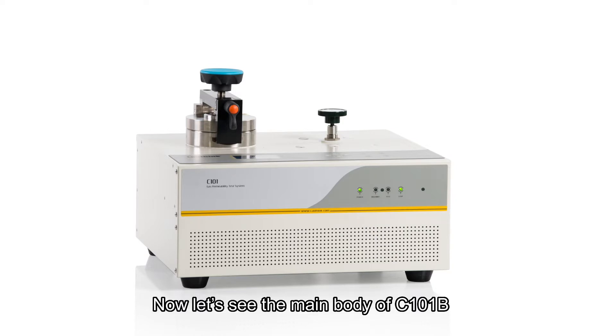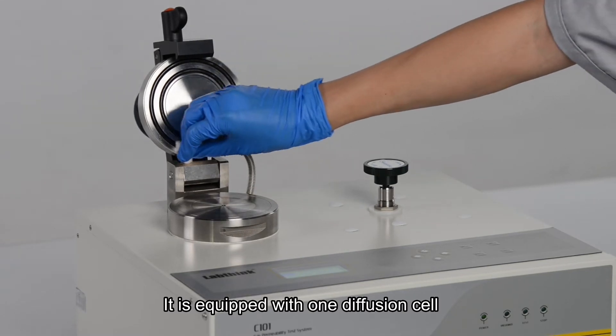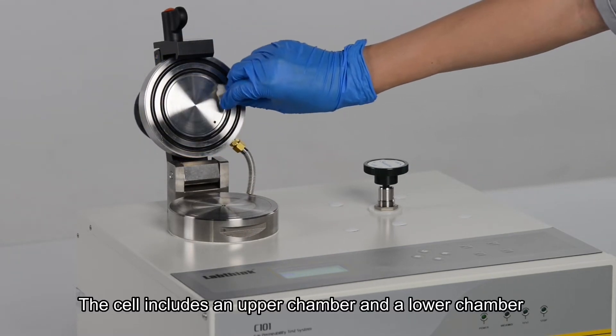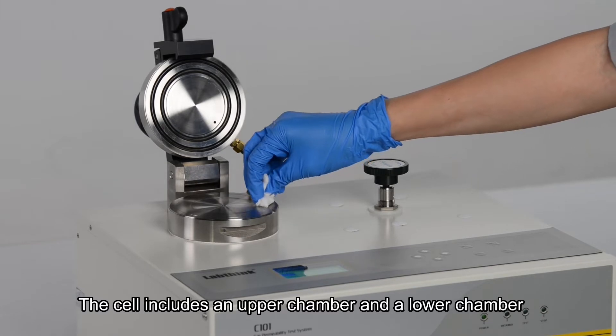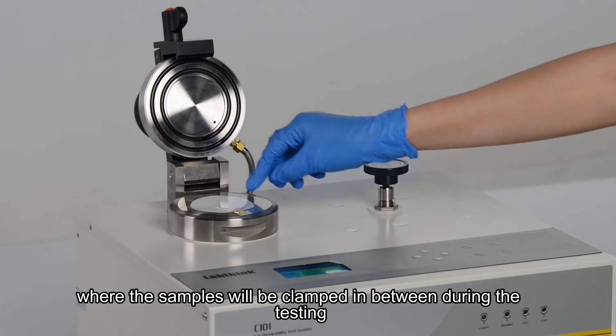Now let's see the main body of C101B. It is equipped with one diffusion cell. The cell includes an upper chamber and a lower chamber, where the samples will be clamped in between during the testing.